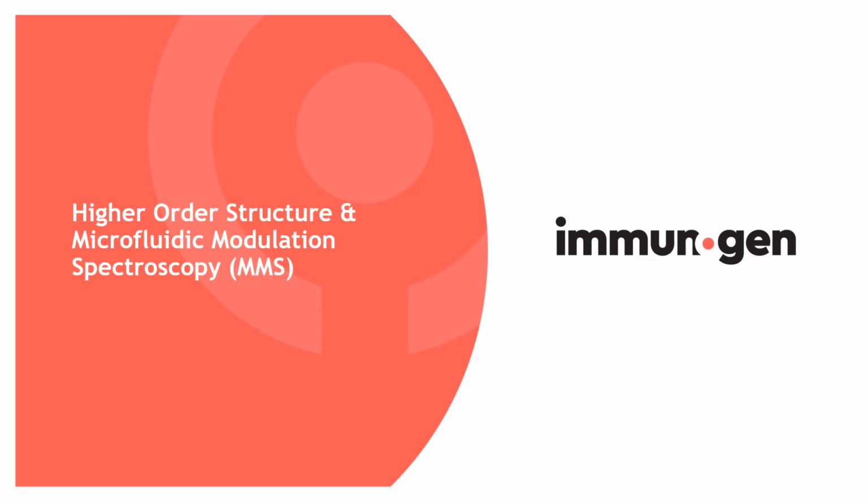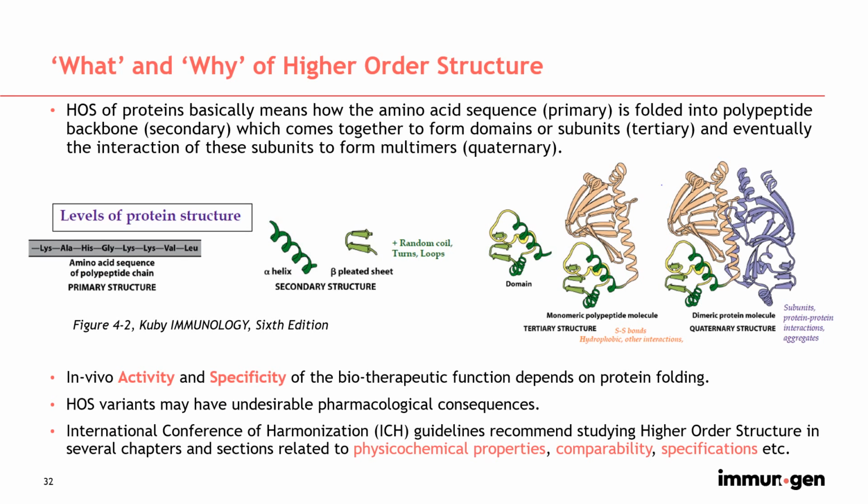Moving on to higher order structure of proteins and microfluidic modulation spectroscopy. So what is higher order structure?